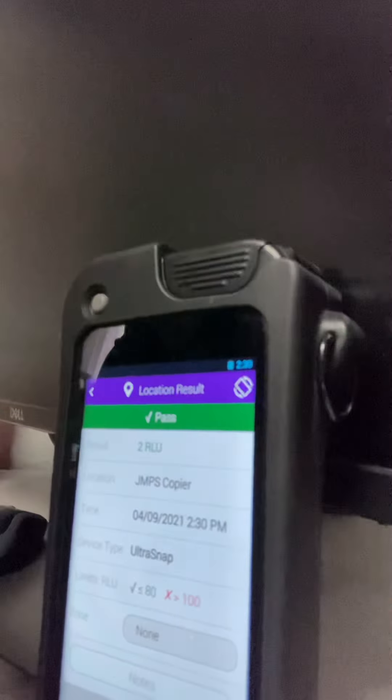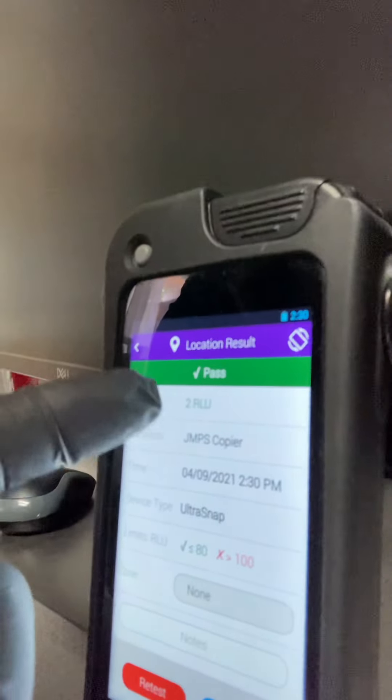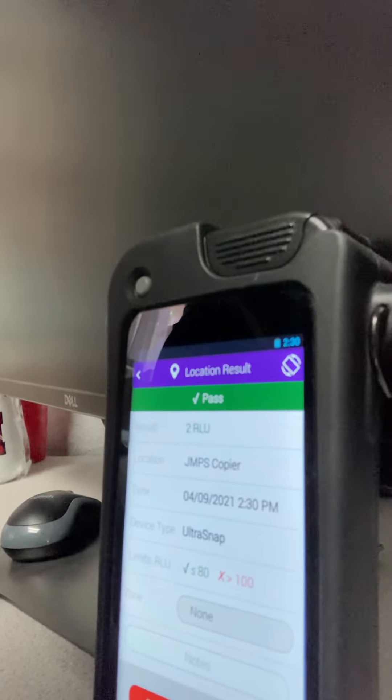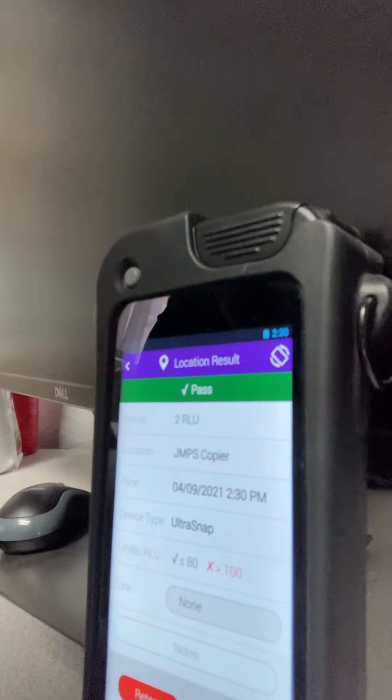And there you have it — two RLUs. It is just unbelievable. Anything under 30 RLUs on an ATP luminometer is food safe. We have seen numbers over 10,000 before.